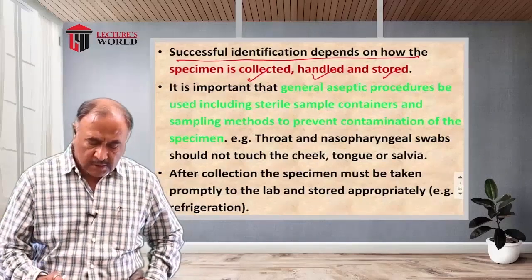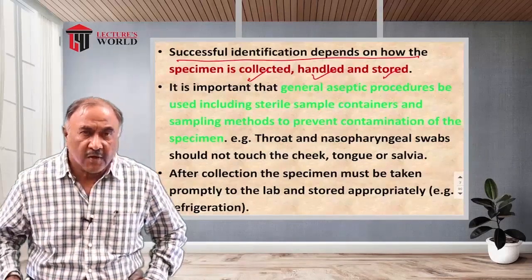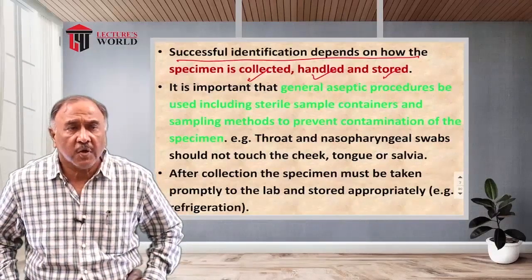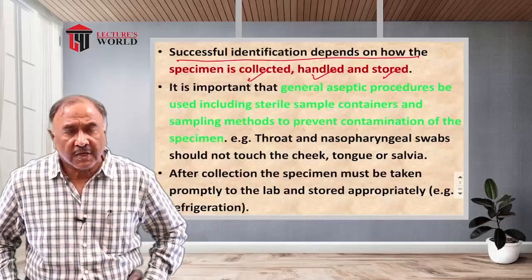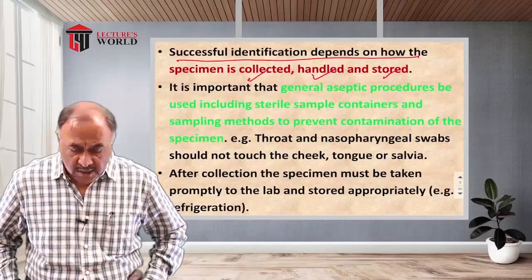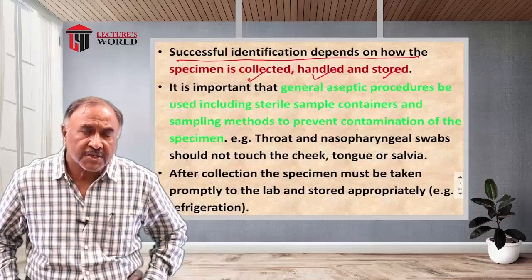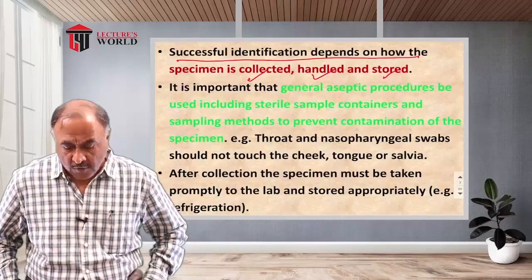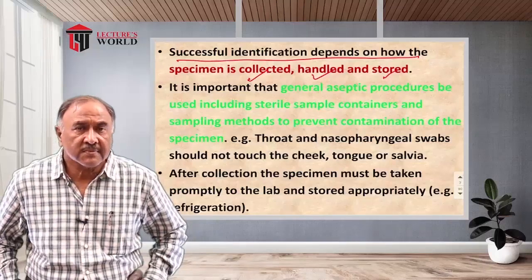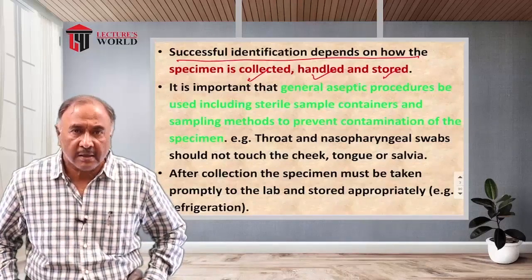This would lead to differentiation of bacteria when we observe them under the microscope. Some of the organisms appear as gram positive, which are stained purple or violet in color, while gram negative organisms are stained pink in color.